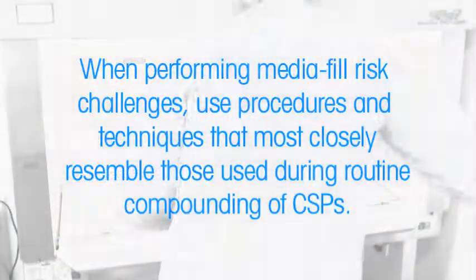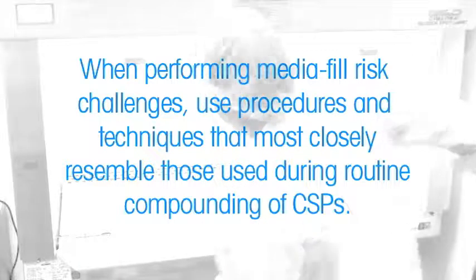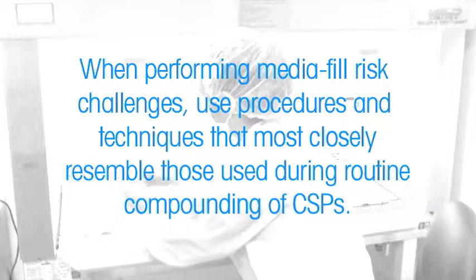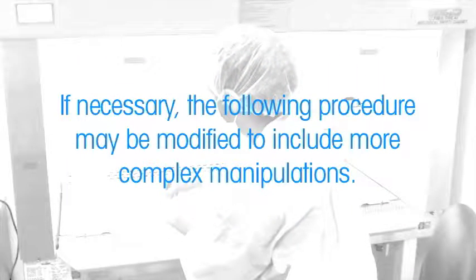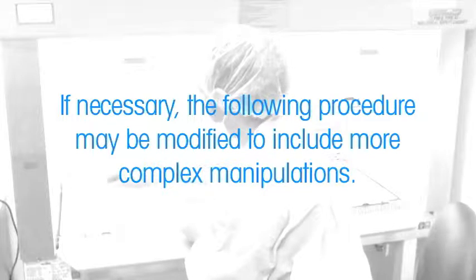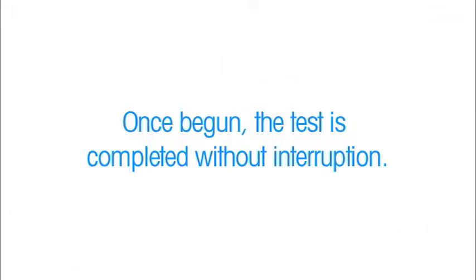When performing MediaFill Risk Challenges, use procedures and techniques that most closely resemble those used during routine compounding of CSPs. If necessary, the following procedure may be modified to include more complex manipulations. Once begun, the test is completed without interruption.